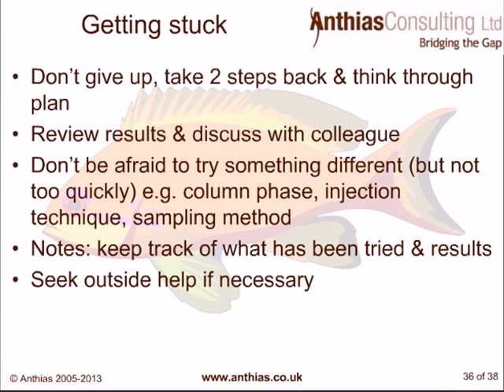Getting stuck? Don't give up. Take two steps back and think through your plan. Have a look at your plan, review it, discuss it with a colleague. And again, if you've written your plan in the first place and kept it up to date with what you've tried and where you've been, this is much, much easier.